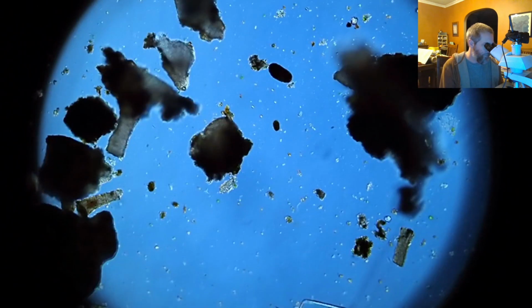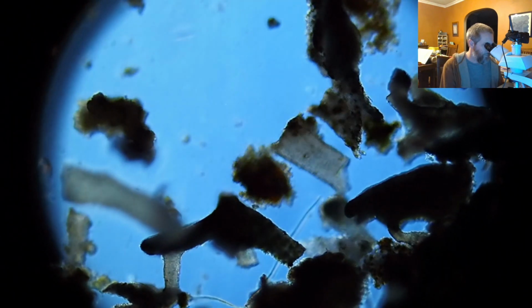We'll look at some cool Christmas tree material. I don't know that I've looked at pine trees very frequently, or spruce trees. I think most Christmas trees are spruce trees. I don't think that I've looked at those very carefully for water bears. So that might be a really cool environment. It's a little bit different type of material.